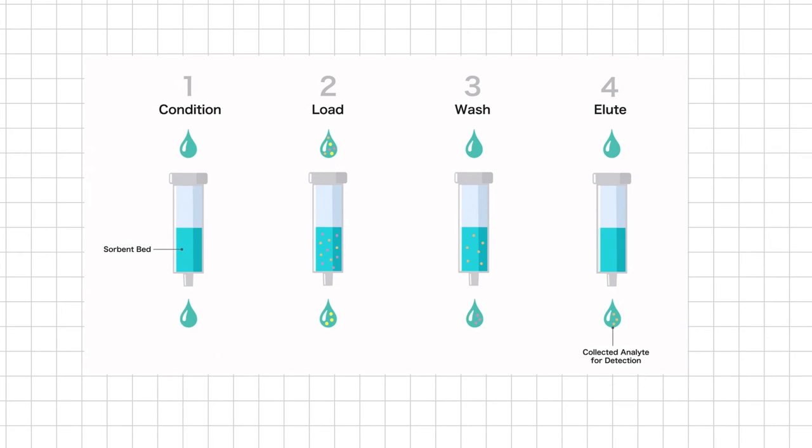Once the sample has been collected on the adsorbent, the cartridge can be rinsed with 100% water to remove unretained compounds. Further rinses can also be done with increasing percentages of some organic solvent such as isopropanol to remove compounds in order of decreasing polarity. At the end, the samples are collected, and the separated samples are then sent to a detection device in order to determine their quality and quantity.